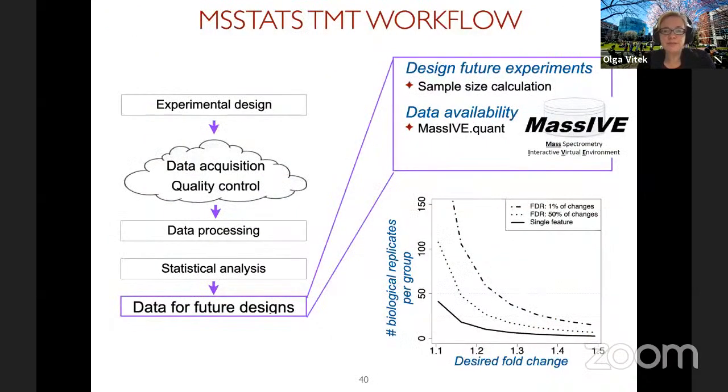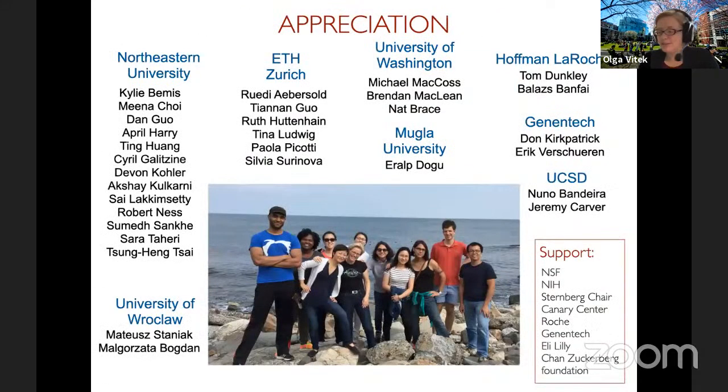And of course, as always in MSstats, we try to use this as a pilot study for future investigations, so we can produce this type of sample size calculations. And we also work with MassIVE and MassIVE.quant for submitting the results. And we will talk about MassIVE.quant actually tomorrow. So I hope that you will stay in for that. So now let me finish here.